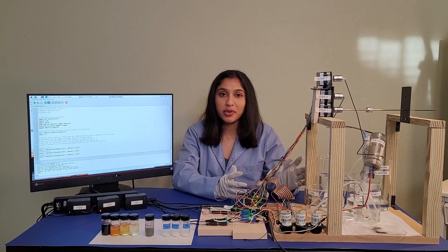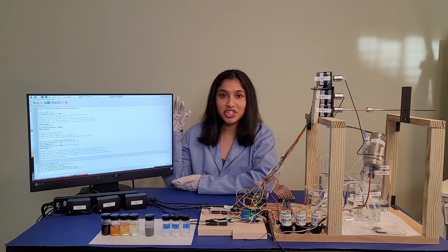My prototype is powered by a Raspberry Pi which controls all the hardware in my prototype. Here is my Python code which controls the filtration sequence.